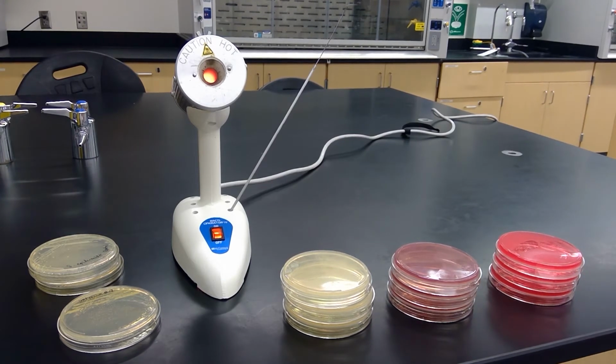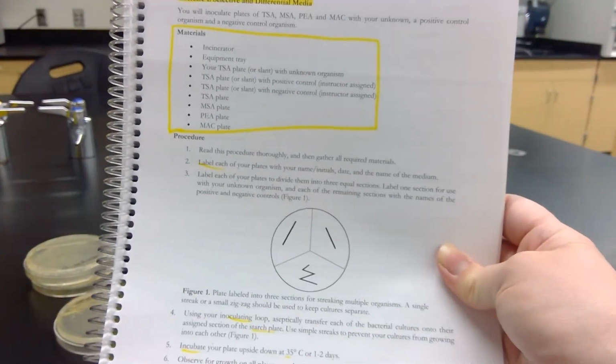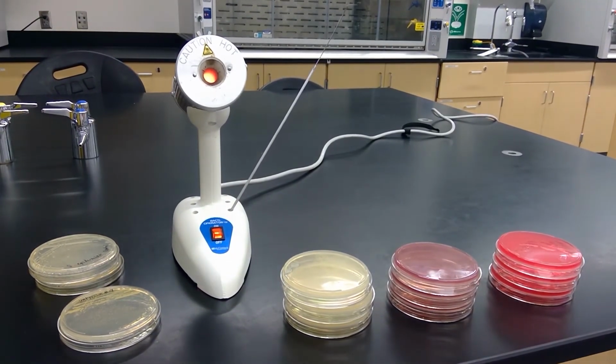So now we will label our plates before we begin. Normally it tells you to divide one plate with your unknown and then the 2 controls, but we found that often it'll grow into the other quadrant and then it's really hard to determine your results. So I'm just going to do one streak on 3 different plates so that there's no question about our results.